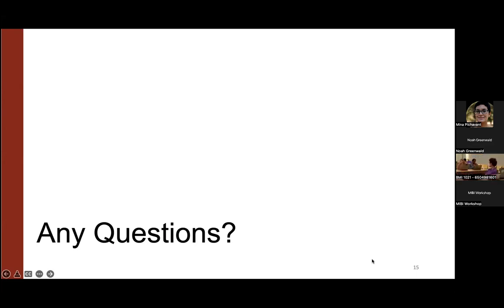What's the theoretical limit on the number of MIBI channels, and what's the practical limit? I would say practically right now it's about 40. In the lab, we're trying to expand upon that, but for now, from a practical use, it's about 40.